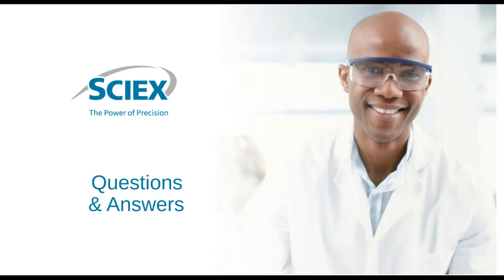If you look at this sort of approach, within SCIEX, I'm working with Marcus Heinl to look at sensitivity limits. We're really analyzing standards which are at around a nanogram per mil level. And when you're only injecting nanoliters of sample, it really is more sensitive than a standard SDS page approach. But it really depends on loading, because you say you load more on SDS page. And you can see also on slide 22 how reliable the data is if you do multiple injections as well. So that gives you an idea of how robust the assay could be.